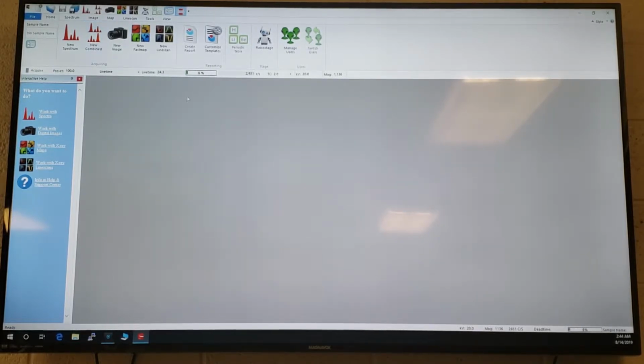So if you have a 1 kV beam, you're looking at an E-beam, you're only exciting up to about 0.8, so you can see carbon and oxygen with your E-beam, which you never even see with your XRF source. And then your XRF source lights up from aluminum and above, and then you see everything there.